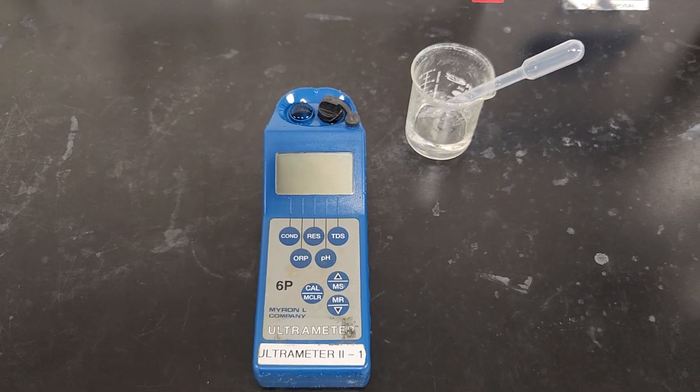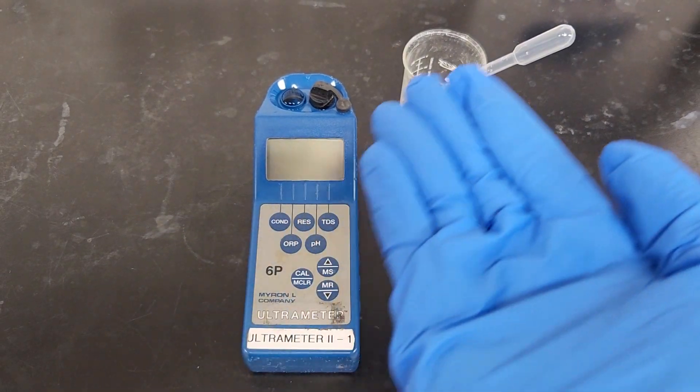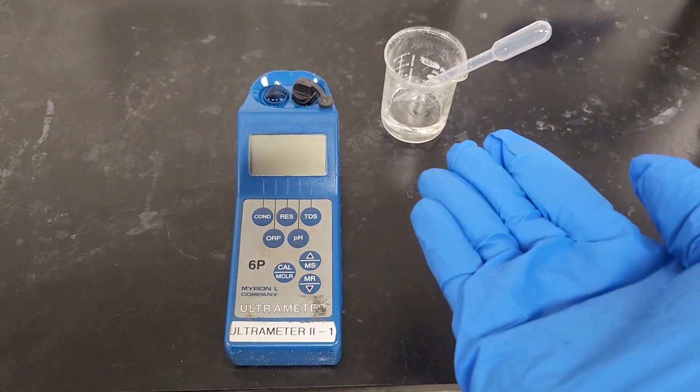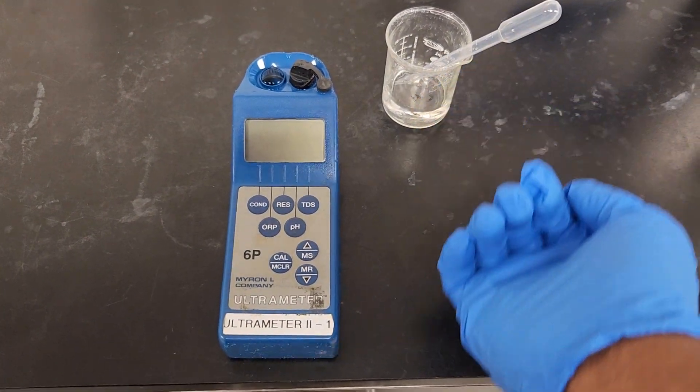Hi, in this video by the end of the day we'll be able to measure the conductivity of a sample and at the same time the total dissolved solid of a sample. So first of all, this is the sample. You use the sample to rinse the equipment three to four times before actually setting up the sample inside of it.